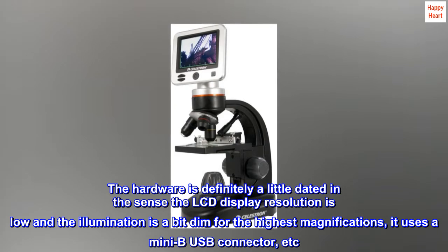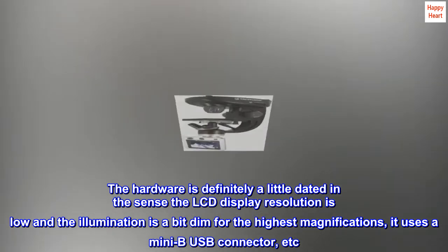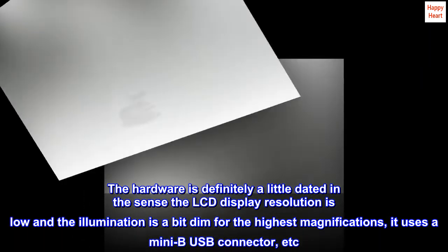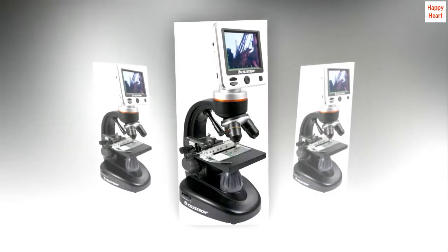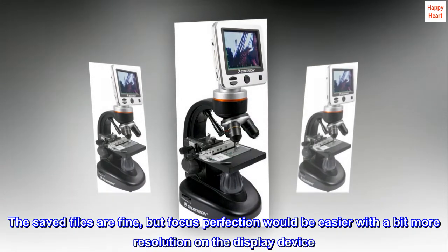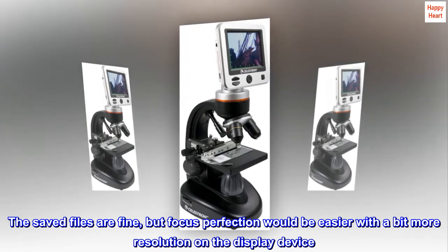The hardware is definitely a little dated — the LCD display resolution is low and the illumination is a bit dim for the highest magnifications. It uses a Mini-B USB connector. The saved files are fine, but focus perfection would be easier with a bit more resolution on the display device.